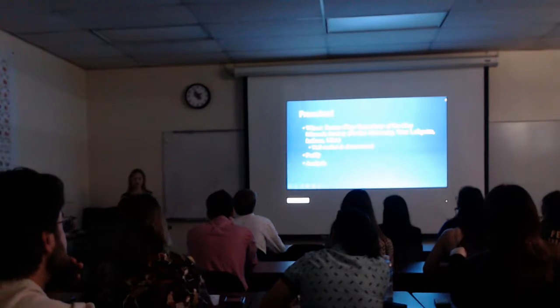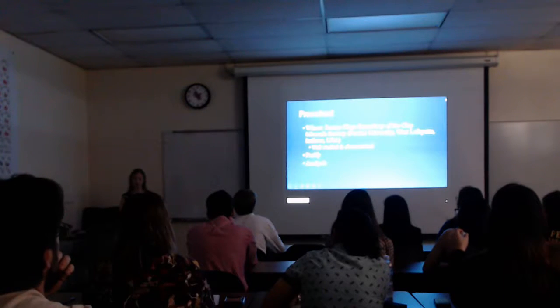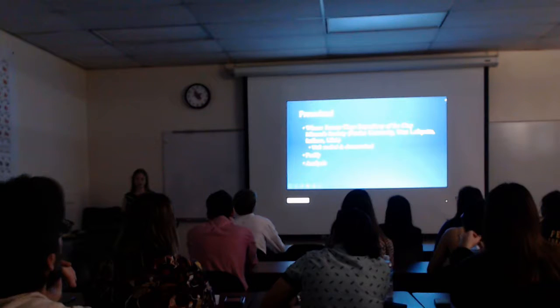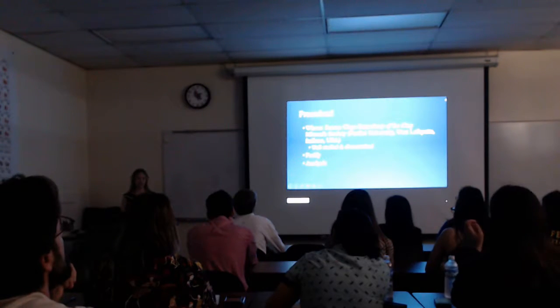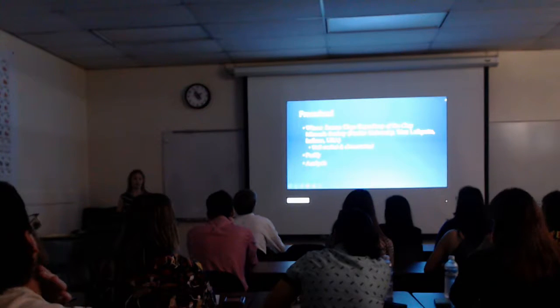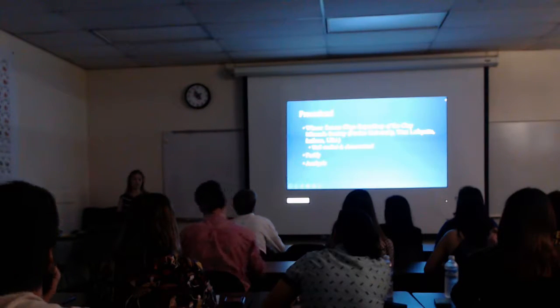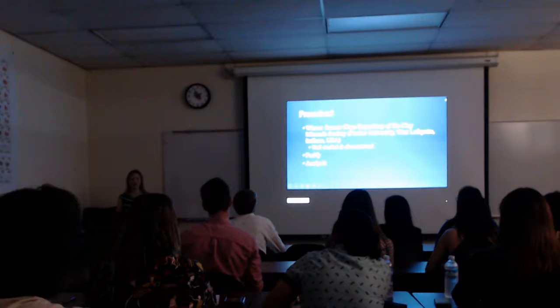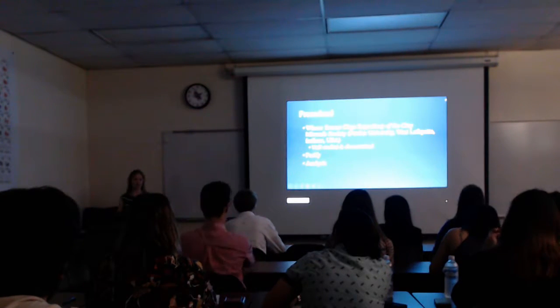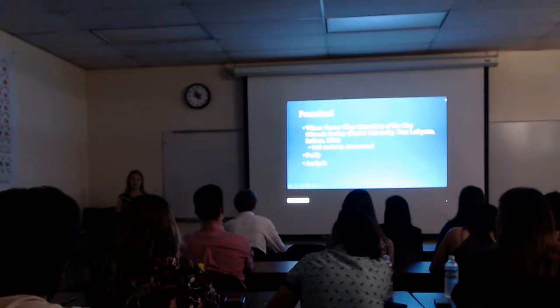We also get our clays from a standard source clays repository at Purdue. Then these clays are very well studied and characterized over the years so that they are actually a standard. This is why we're able to compare our error to a known quantity. Then we have to purify our clays to ensure that we actually have just the clay that we want, and then we can undergo analysis.